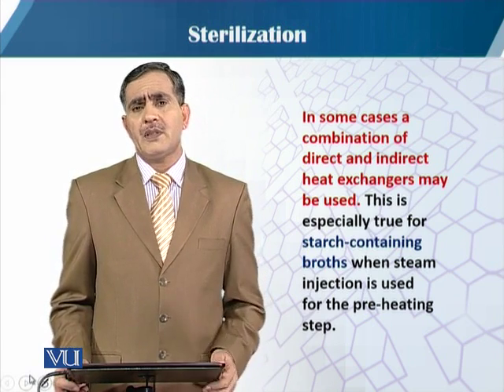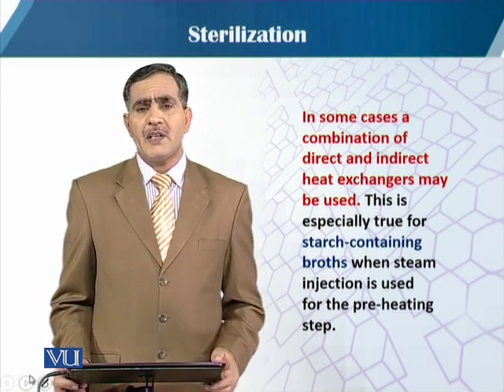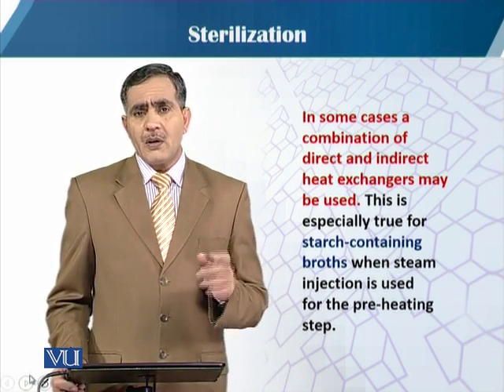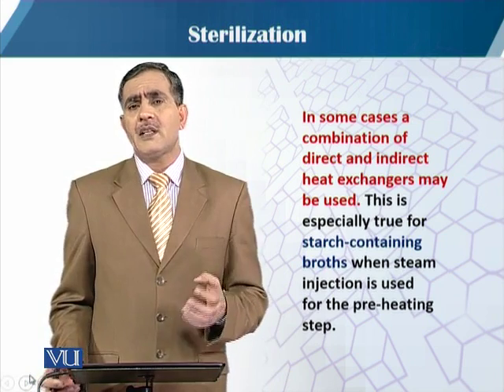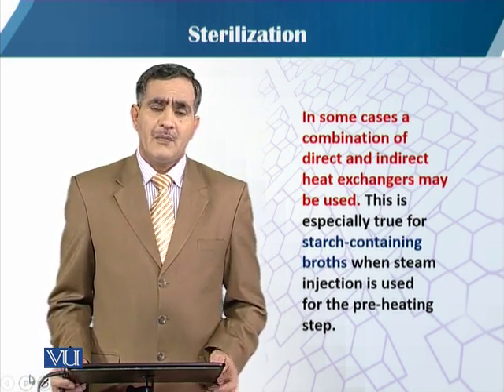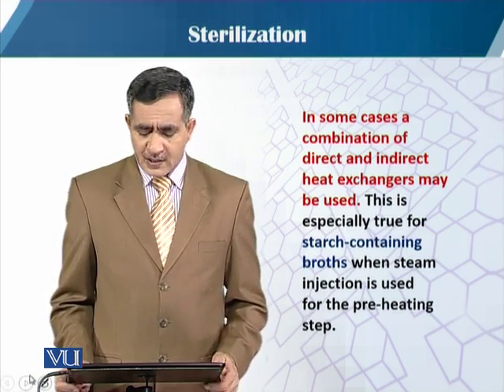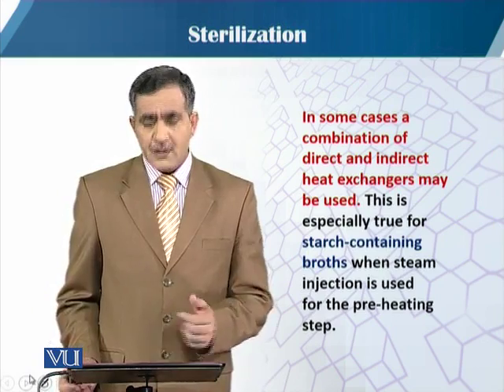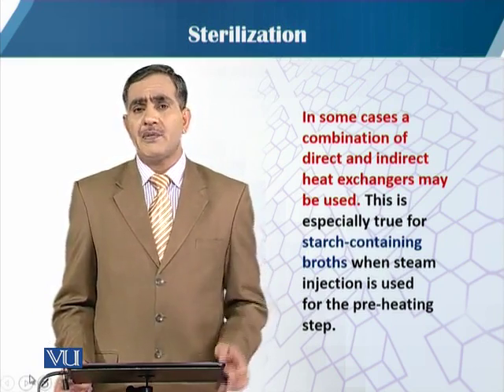But when we focus on solid state fermentation, there is a limitation. In solid state fermentation, the only choice is batch sterilization. Continuous sterilization is mostly recommended for submerged fermentation or liquid fermentations.